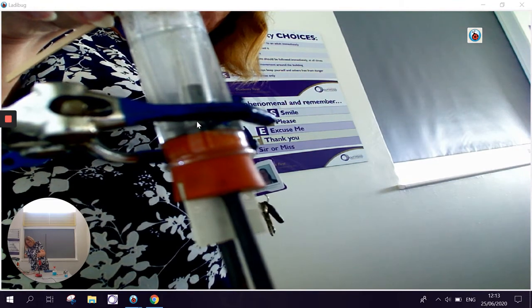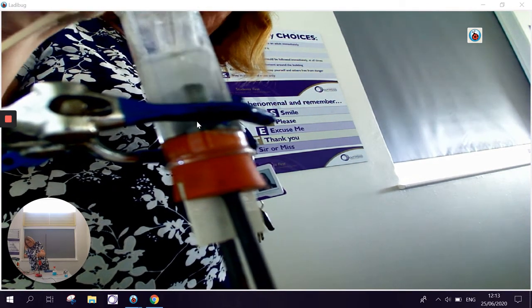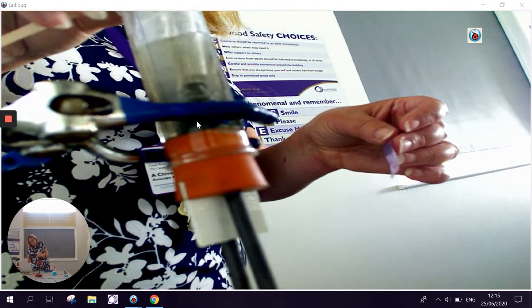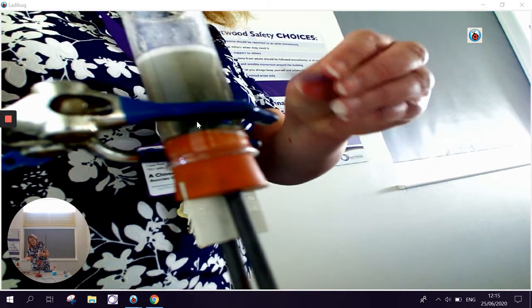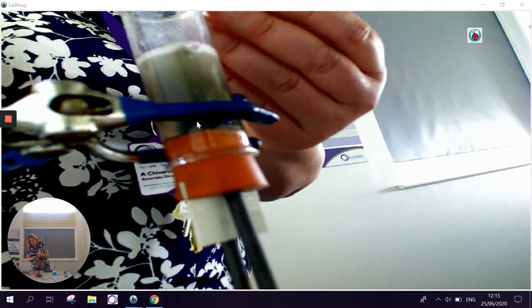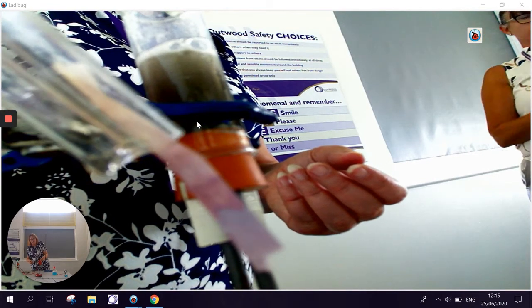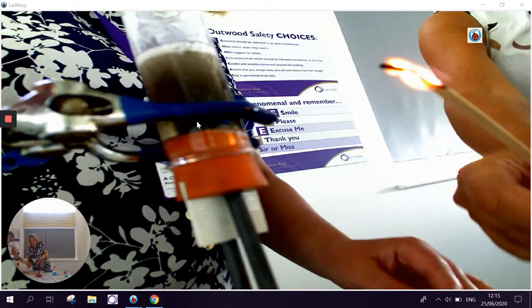Hopefully we've collected enough of the gases to do a valid test. We're going to test the gas from the positive electrode first, and you should see something very similar to the previous test — you can see on the visualiser that it's clearly chlorine gas again because it's bleached the litmus paper. Now we're going to have a go at testing the hydrogen.